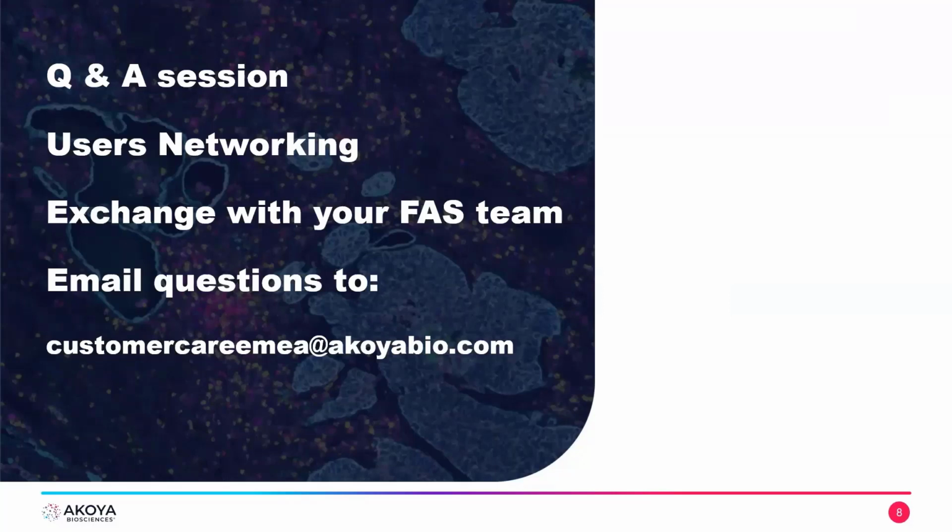Thank you. So we have a question here from Gamal, and the question is, excuse my ignorance, what is the name of the plot used to describe the different cell types? I think there was a question from Björn's presentation, right? I think he refers to the tSNE plot, and tSNE is a plot to basically show high-dimensional data in 2 dimensions. It's similar to principal component analysis, if people are more familiar with that term. But tSNE is just more sophisticated and more applicable to biological data sets, so high-plex biological data sets.